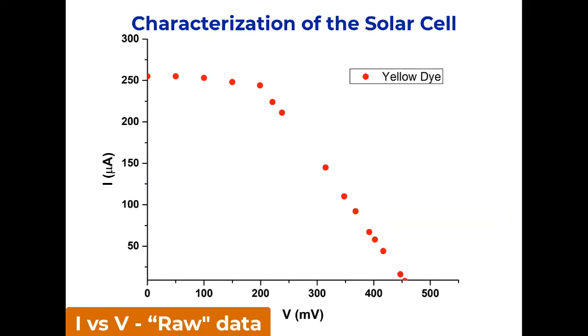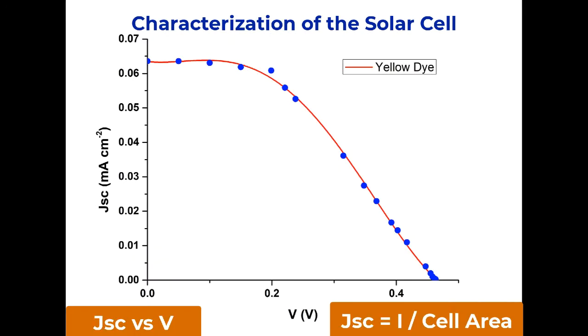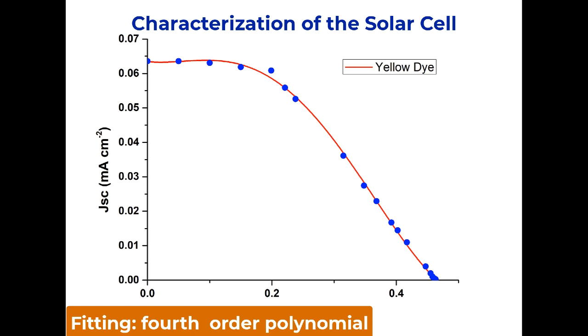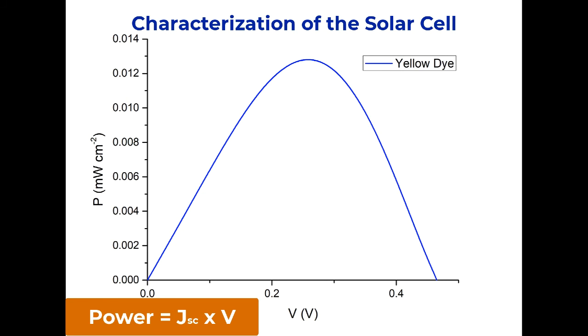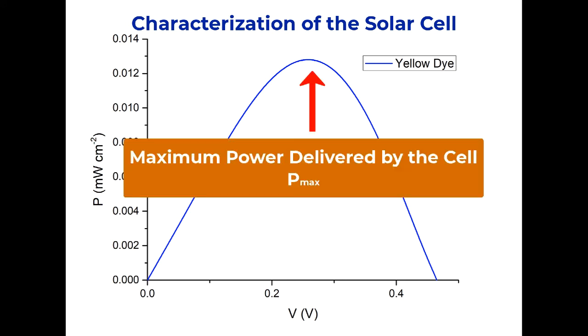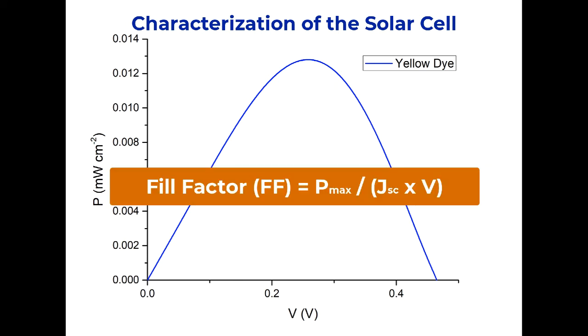Here we can see the raw data reported as microampere versus millivolt. The same data can be reported as current density versus potential. The current density is obtained by dividing the raw current data by the area of the cell. Data can be fitted with a polynomial of 4th degree. By multiplying the current density by the voltage, we can obtain the power. So from the previously fitted curve, we can obtain this curve, which expresses the power versus the voltage. The maximum power obtained here divided by the theoretical power that the cell can deliver will give us the fill factor.